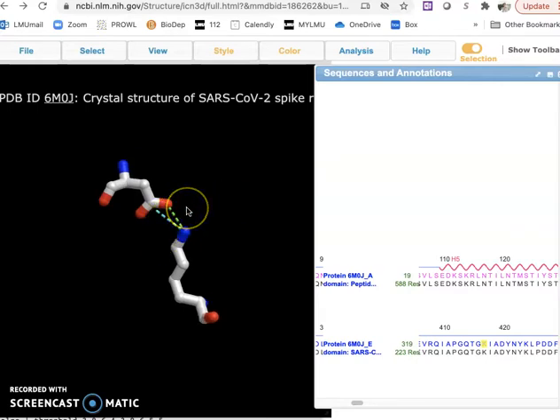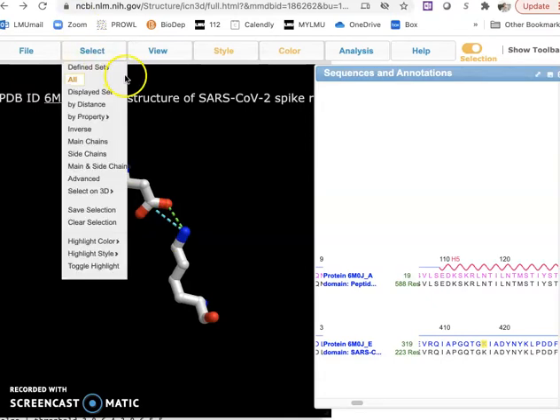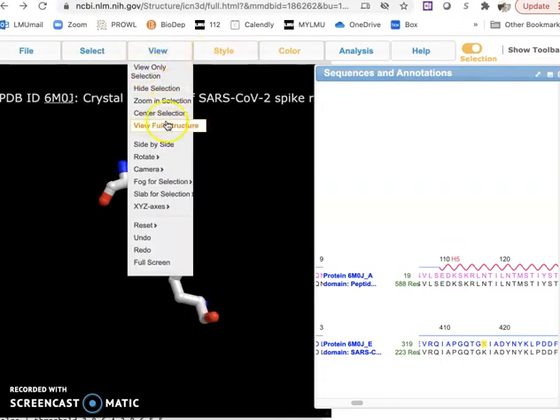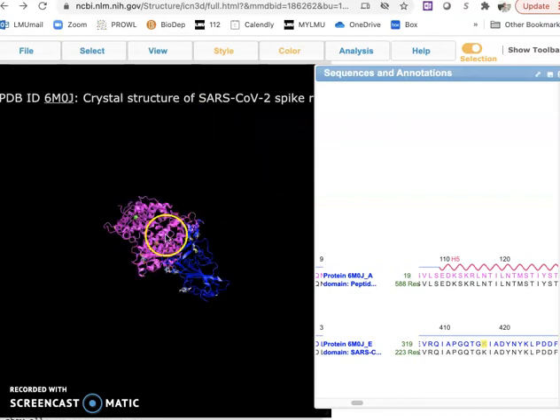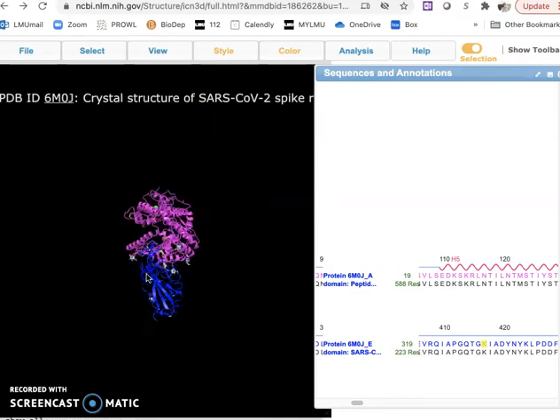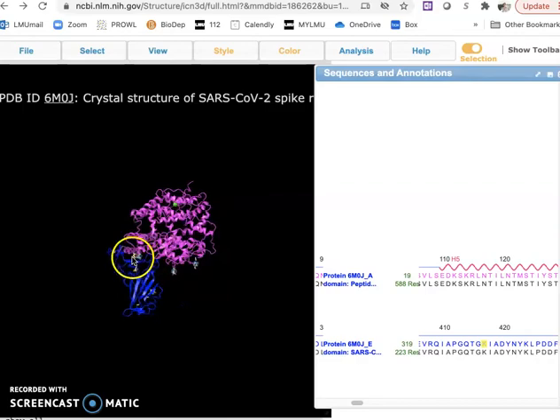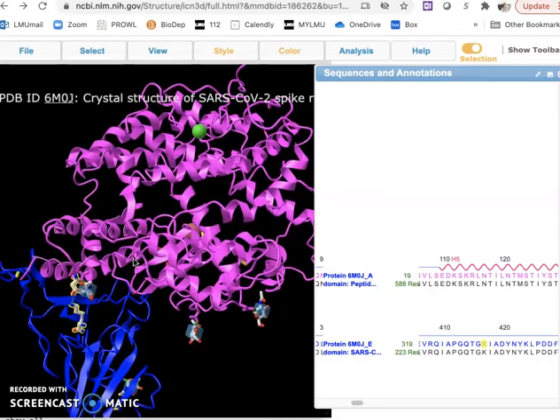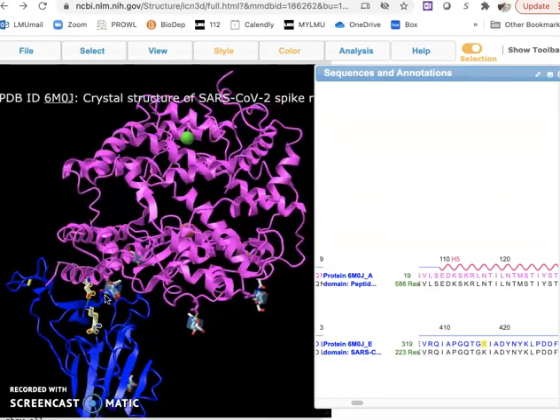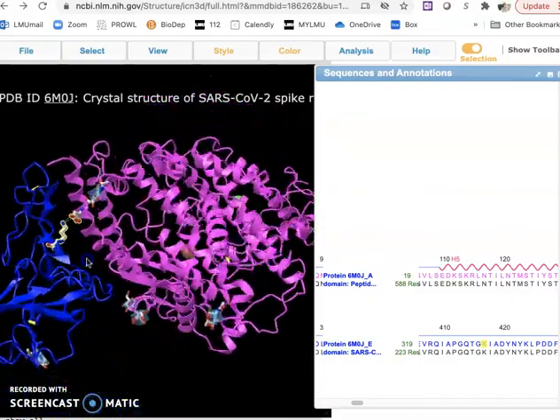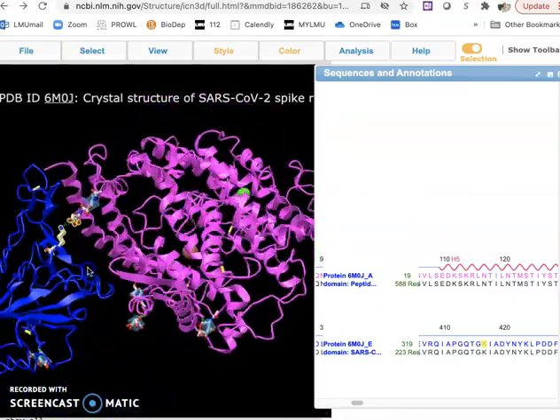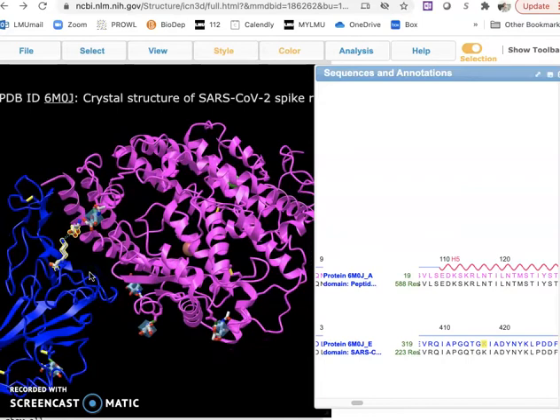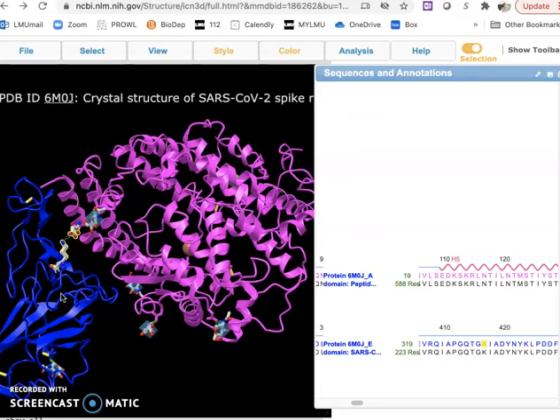You can see I was able to visualize the bond between those two molecules. If I want to see it in context one more time, I would go to view full structure again. It might take me some time to locate my molecules and zoom in, but here they are interacting. You can find the best spots to take a screenshot, and that will be your screenshot right here.